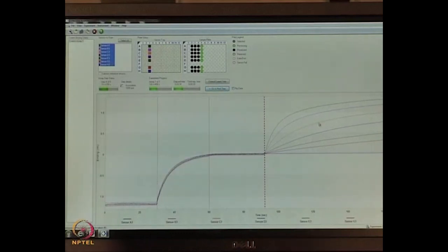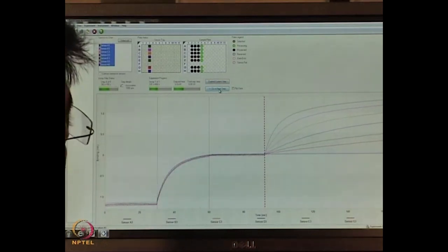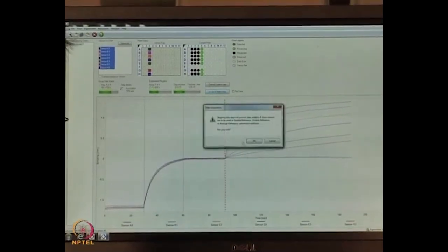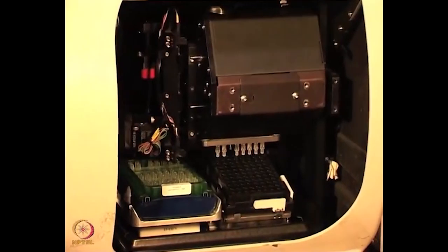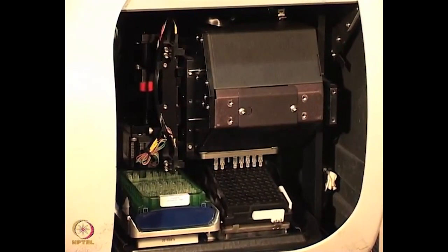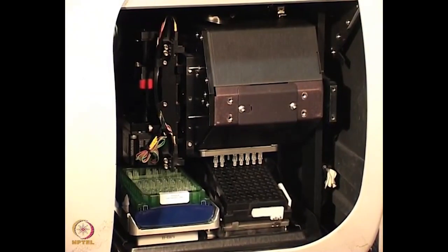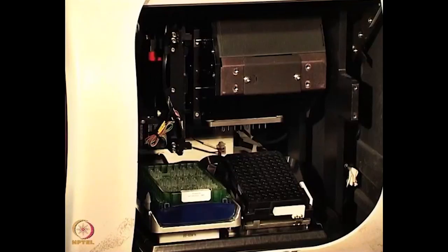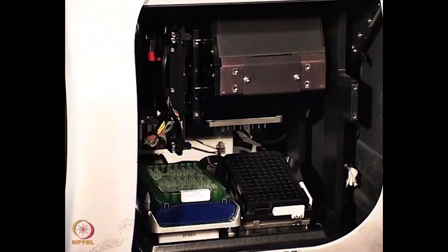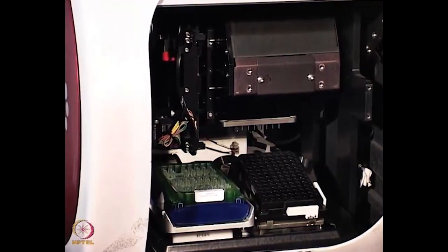In the software we have a function to extend the current step or go to the next step if the curve is already saturated. I say go to the next step — 100 seconds is sufficient for association. The sensors then go back to the buffer well for the dissociation step. If interactions are loosely bound, molecules come off the sensor; if very strong, you see a flat line. The dissociation is performed, sensors re-rack back to the sensor tray, and the instrument moves to its original position. Acquisition is now done.